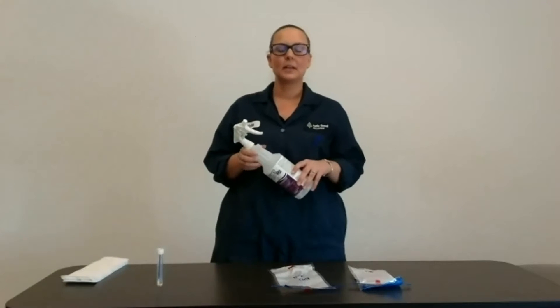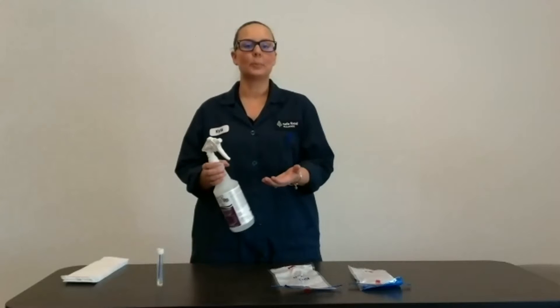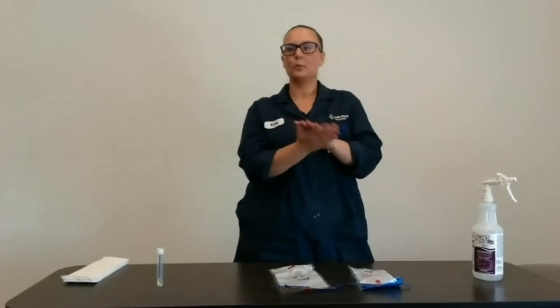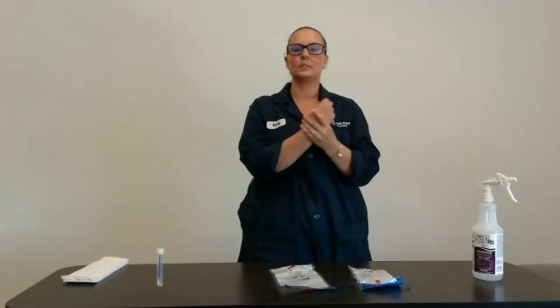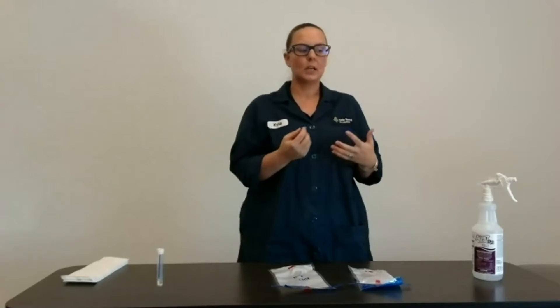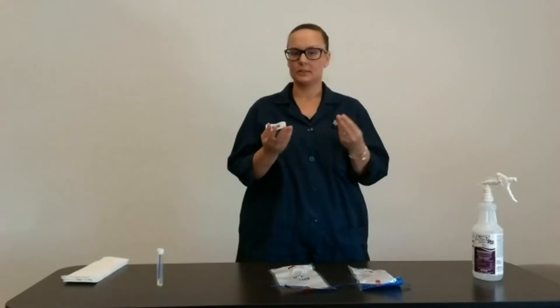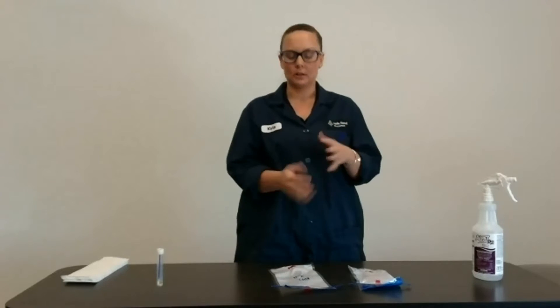I'm going to sanitize my hands with some Alpet. You're probably all familiar with Alpet. You want to spray a little bit in there because when you're out there in the processing facility it's hot and it's hard to change your gloves. Some people actually put on gloves because the Alpet is kind of rough on your hands, and they just sanitize the same pair of gloves.